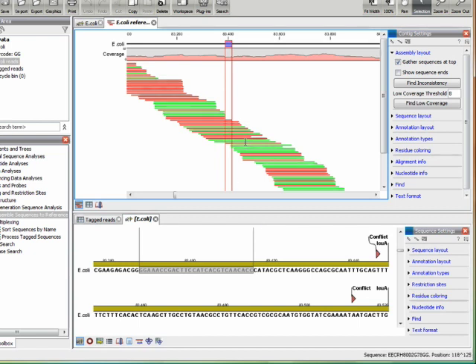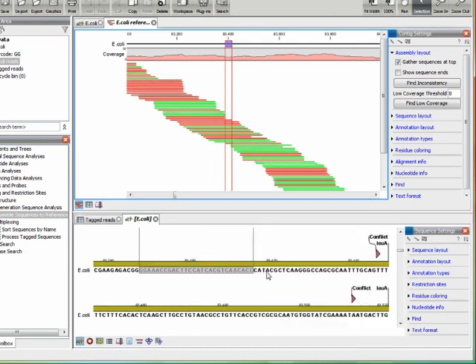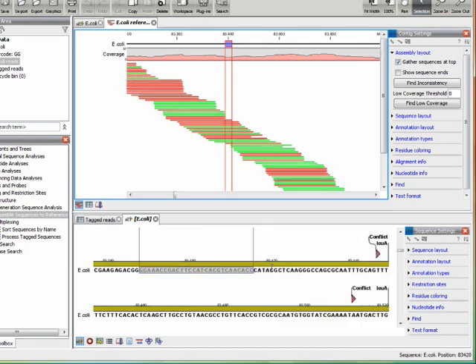This is likely to be the case if there are low coverage regions or regions with zero coverage inside coding regions as specified by the NCBI annotations.